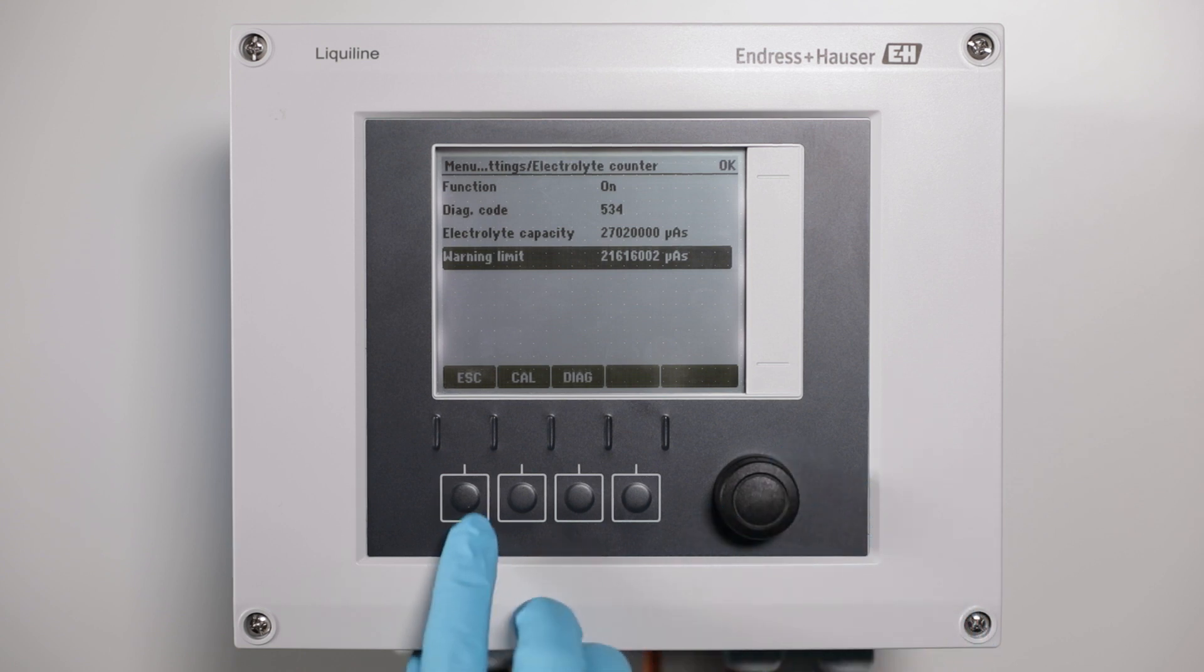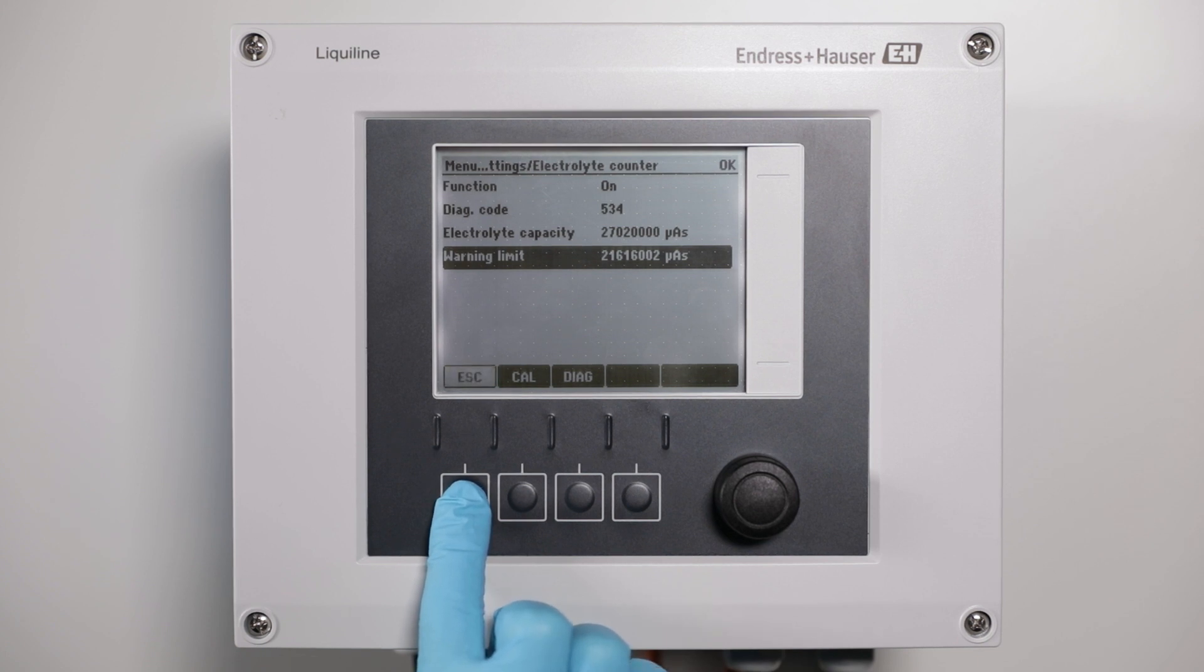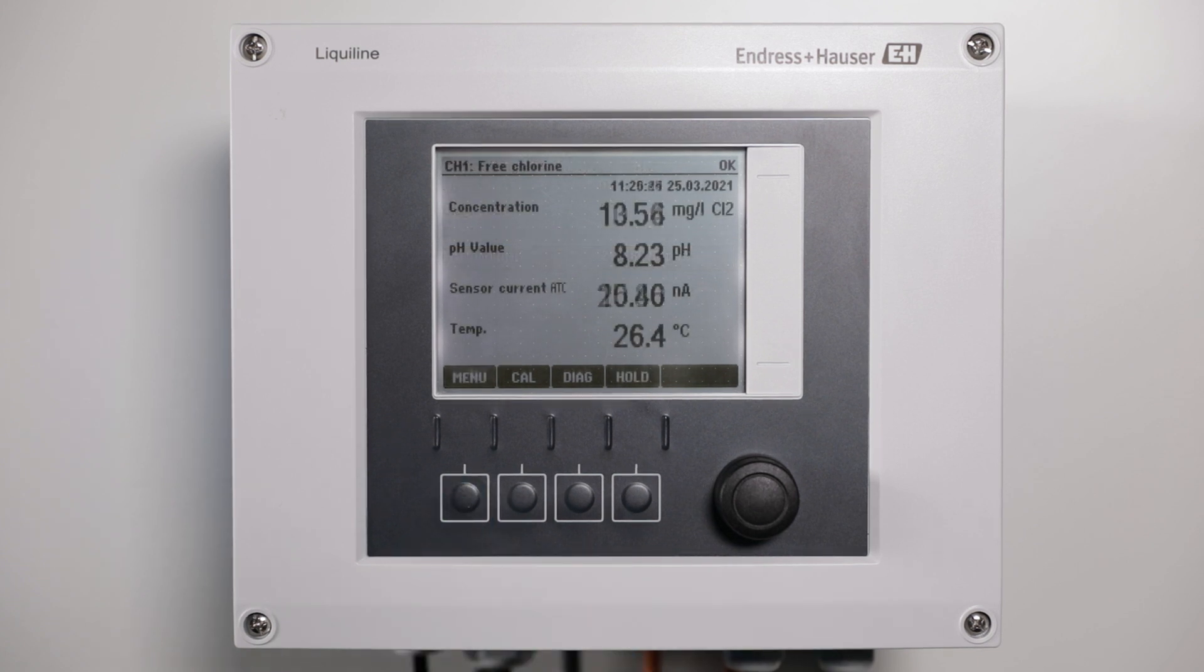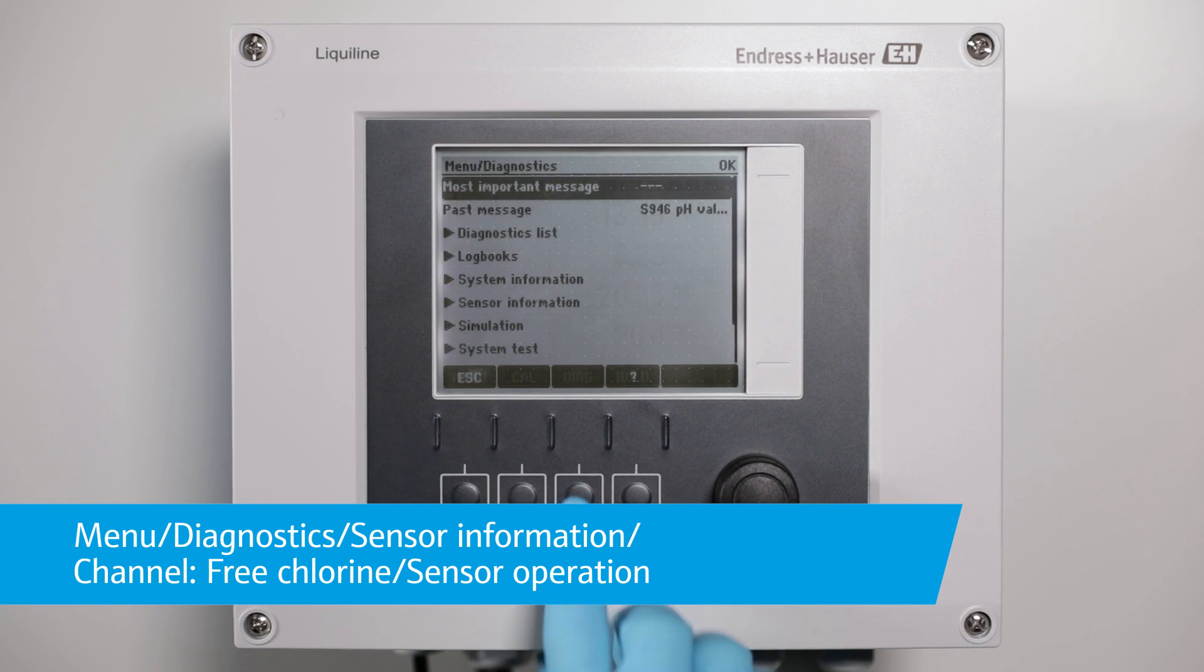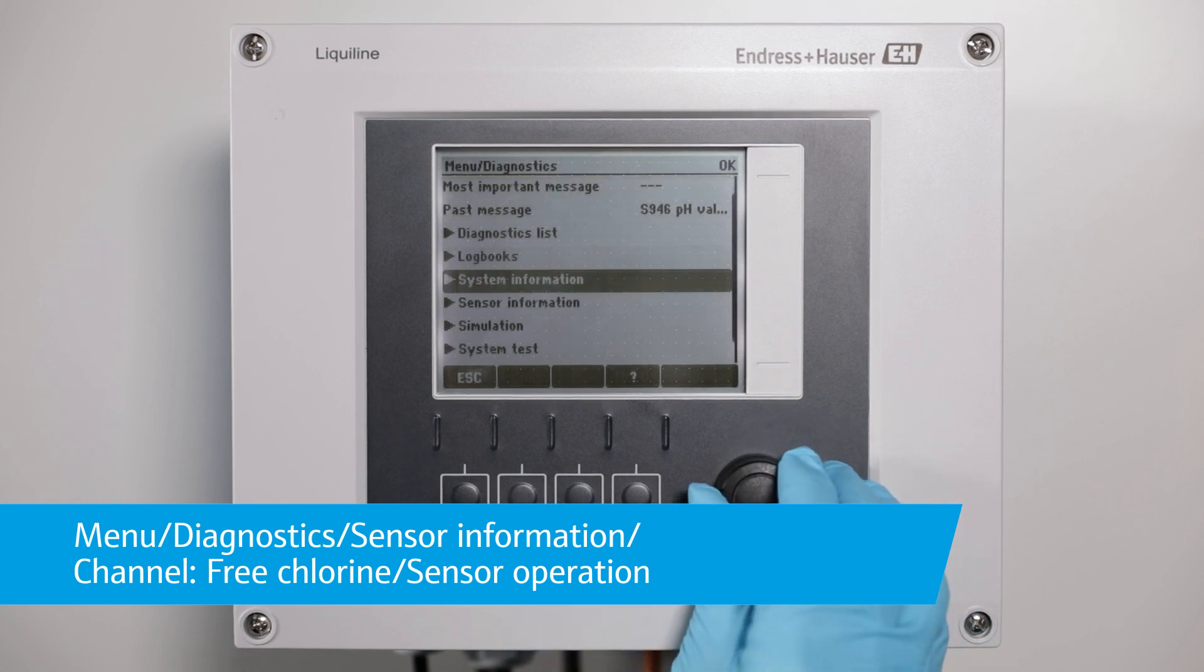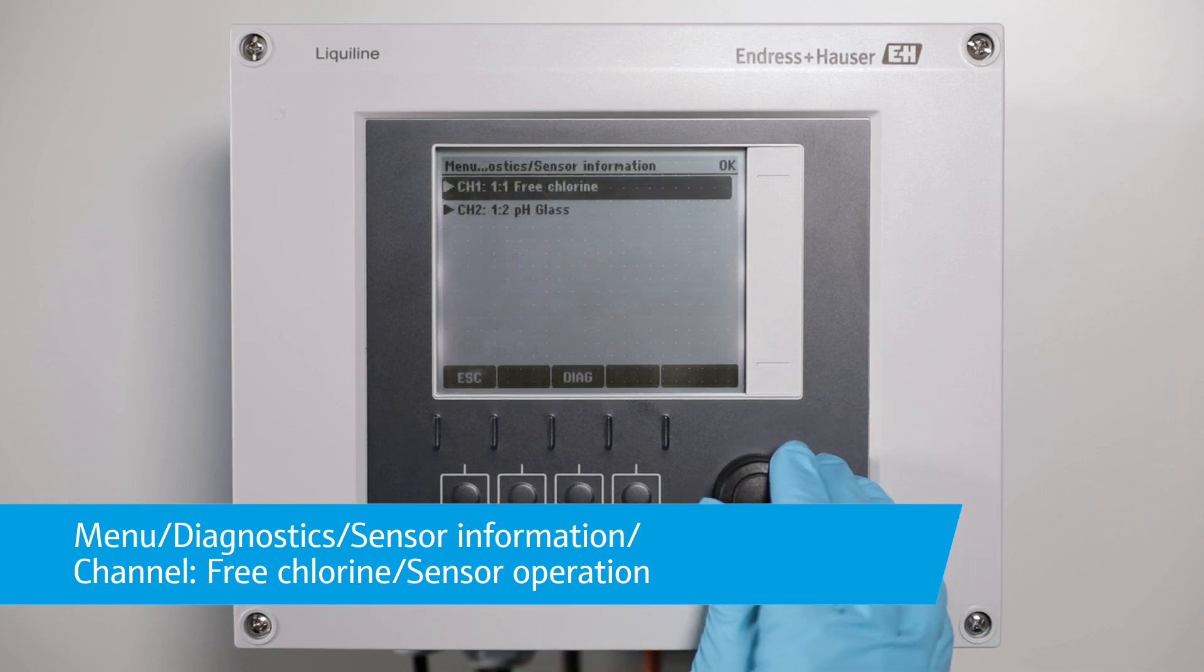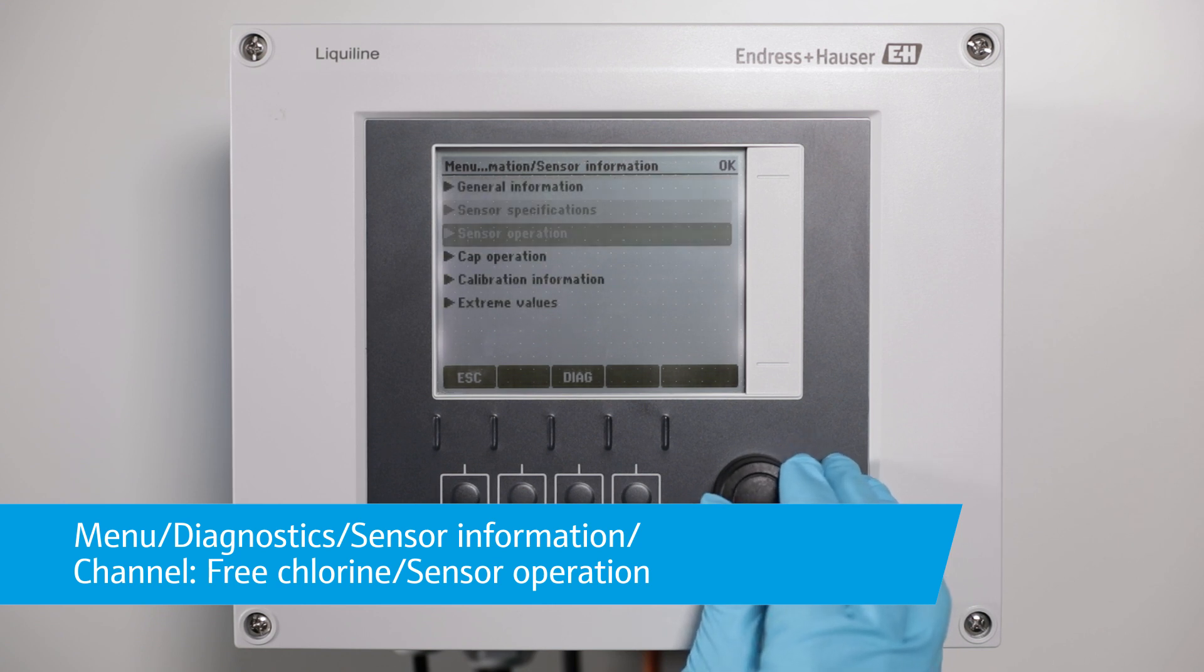Per default, the warning message appears when 80% of the electrolyte capacity is reached. To read out the actual electrolyte consumption, check the charge given by the sensor information in the diagnostic menu.